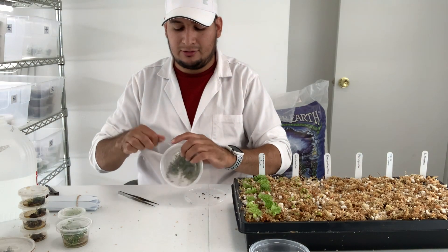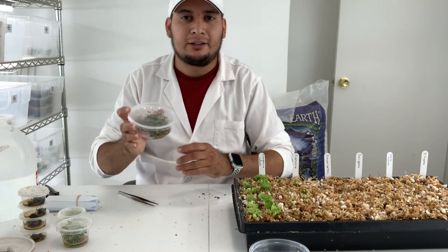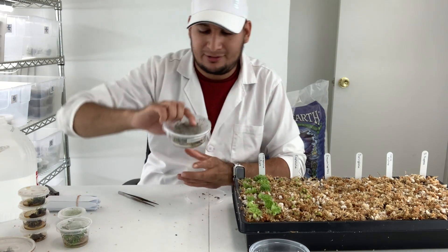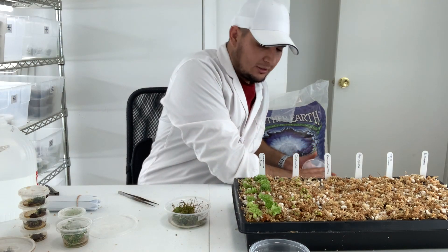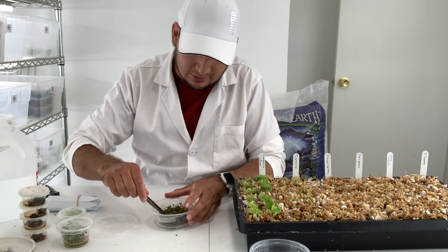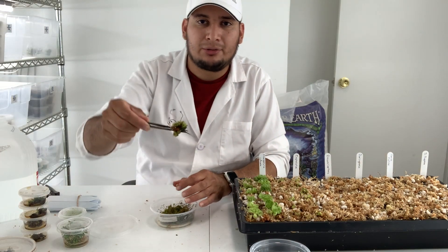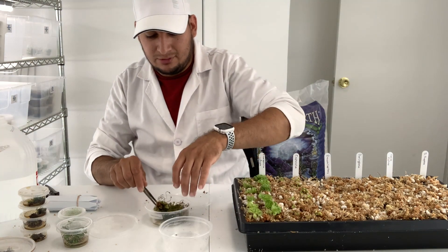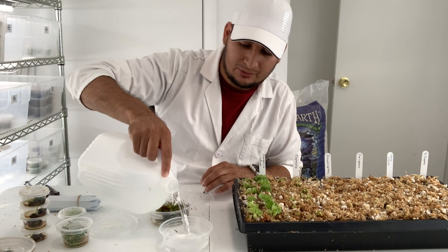Next plant is Drosera capillaris. I may have to wash this plant — let's take a look. Very nice clumps. I'm going to place some water in this cup and give it a little wash.